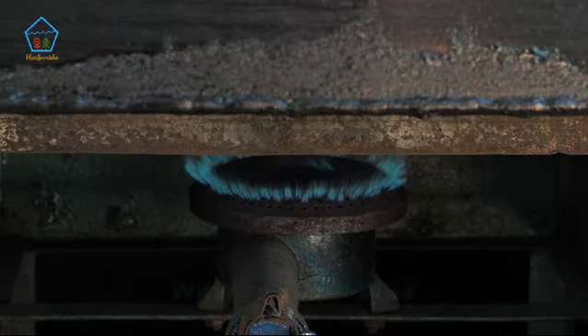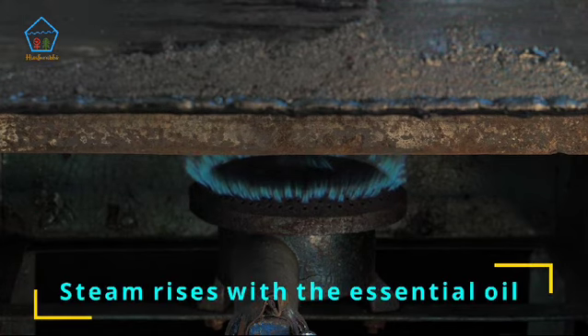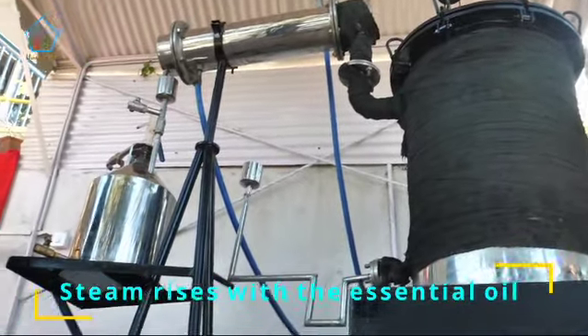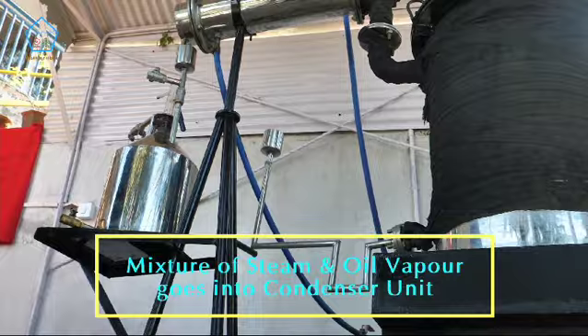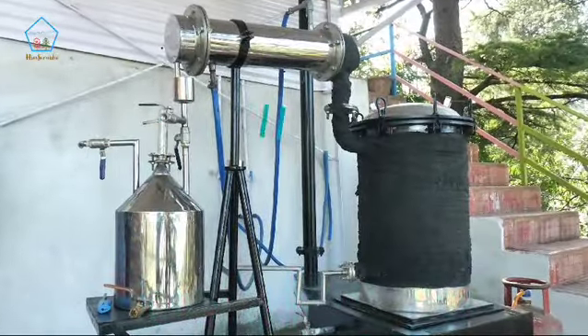It's heated from the bottom so the water evaporates. The steam which is generated takes the oils from whatever material we have put in, and that mixture of steam and oil vapour goes through this to the condenser unit.